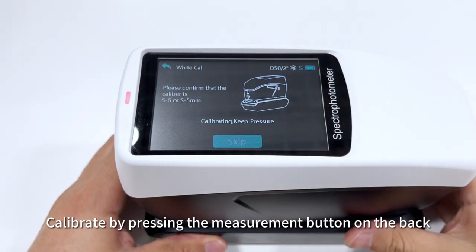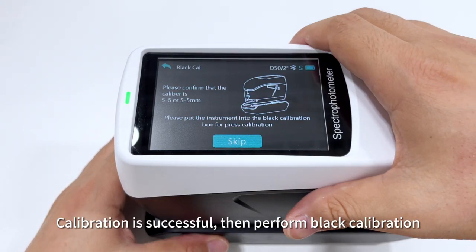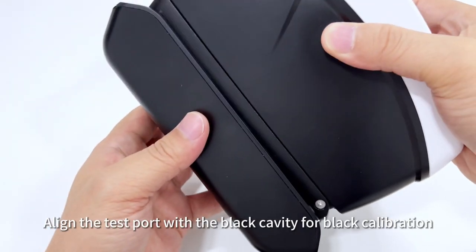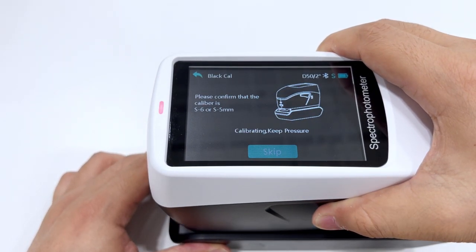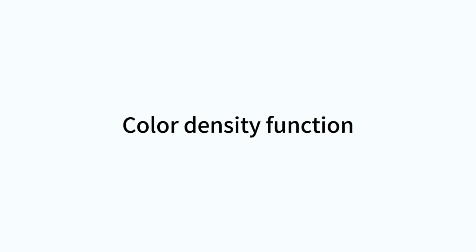Calibrate by pressing the measurement button on the back. Calibration is successful, then perform black calibration. Align the test port with the black cavity for black calibration. Calibration completed.